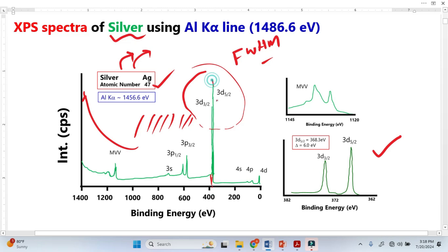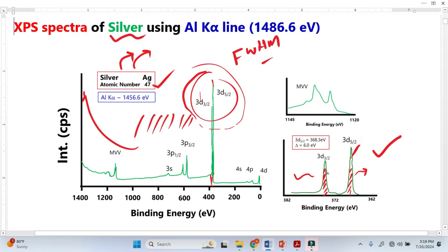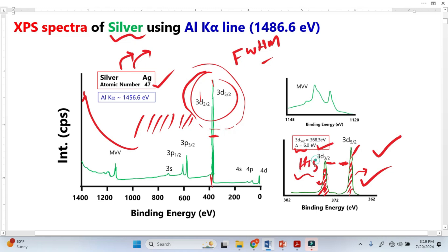When we resolve this important peak using high resolution, we can now clearly see it. We can see the area under the peaks. In this case, one orbital has more electrons than the other because the area is greater, meaning that peak contains more electrons. The separation between the two peaks is called the spin orbit splitting, represented by delta. This is the high resolution XPS spectra. Similarly, we also resolve the important Auger electron peak, and it can be shown that there are two distinct peaks.